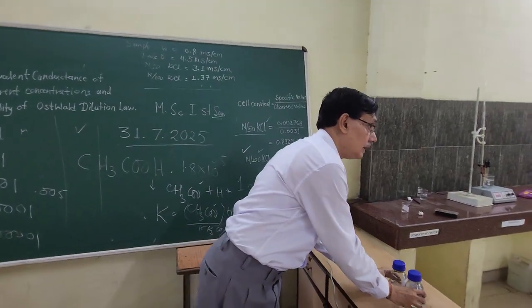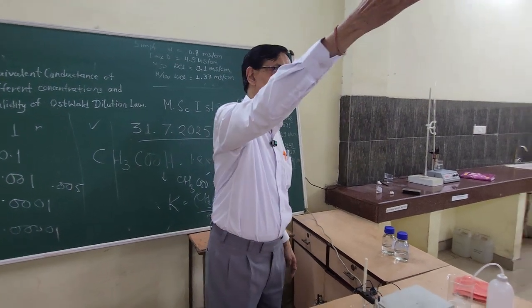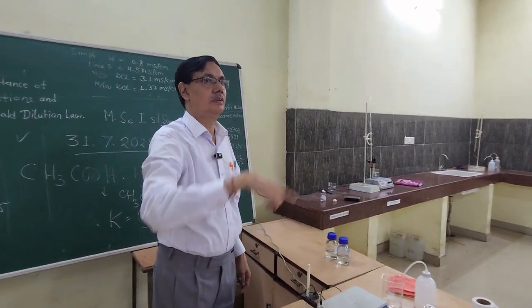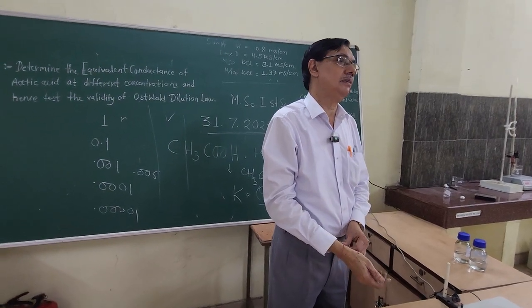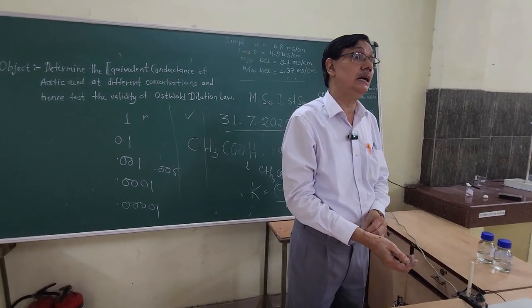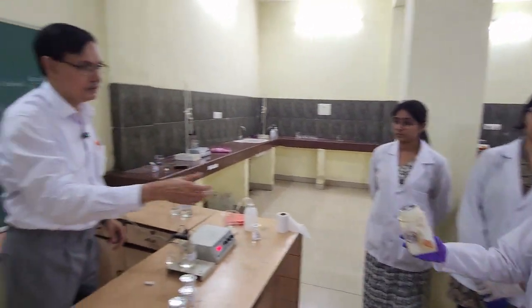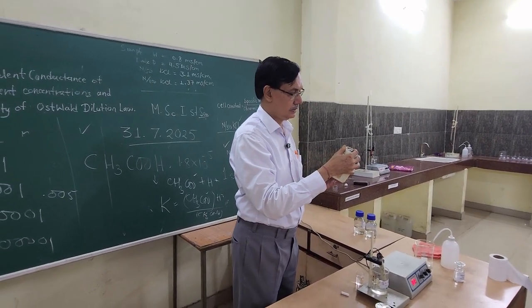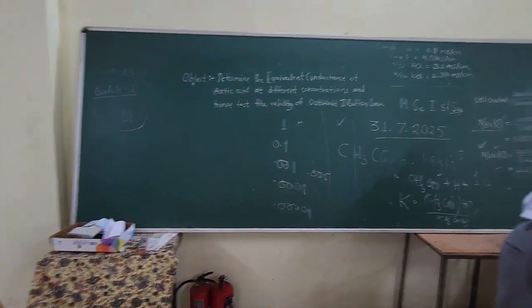अब KCl का दिखाइए, KCl का जिससे आप लोग बनाए हैं वो केमिकल्स लाइए. There are different types of chemicals. Great, bring the KCl. KCl कहाँ से लिया आप? वहाँ पर रखा होगा KCl. What I mean to say, you must know the grade, make of that chemicals. If there are many types of grade, one is called the AR, analytical reagent grade. You must know because you are now chemist, and some are very toxic chemicals. हाँ, ये अच्छा आपने नहीं लाया बॉटल. अच्छा बॉटल लाना चाहिए था आपको, नया बॉटल लाना चाहिए. Anyway, इसको डिलीट कर ये.